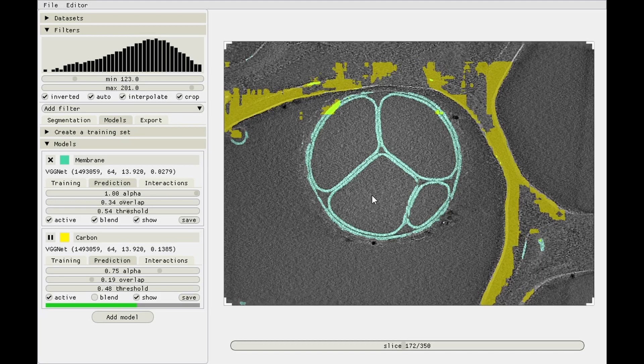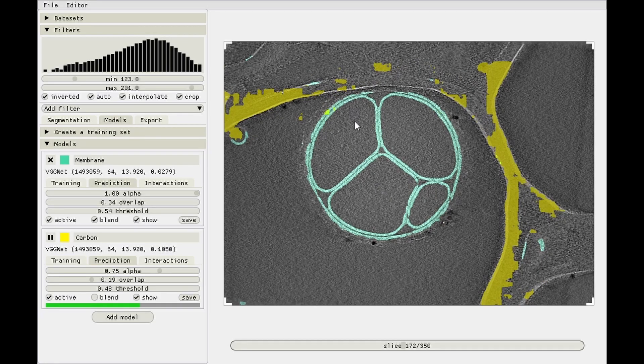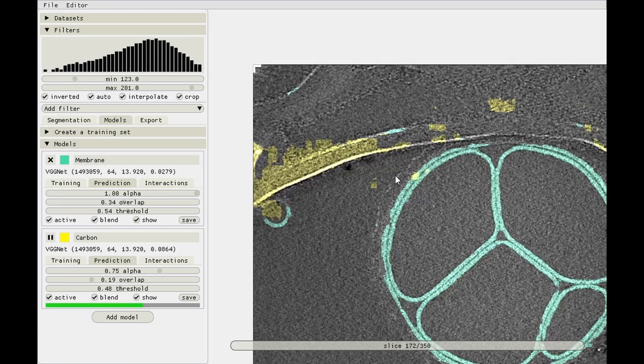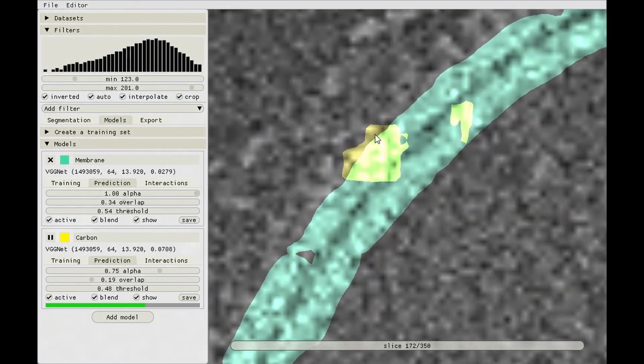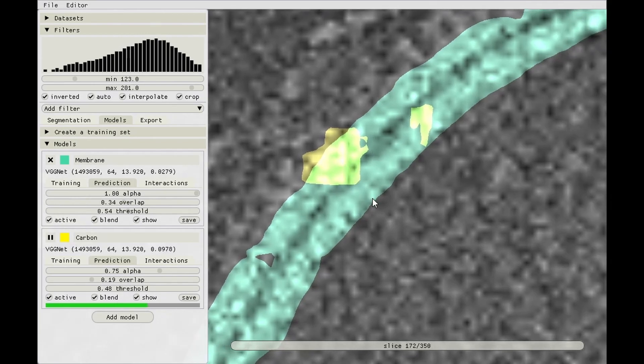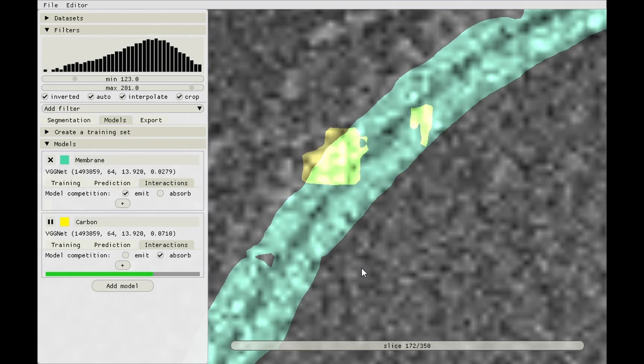Let's activate membrane too. And here you can see that without any model interactions present, as we haven't set those up yet, two models are allowed to both predict the same thing as being other things. So these pixels are carbon as well as membrane. But let's say if we set both models to compete, and the membrane one will emit competition, the carbon one will absorb it, meaning that for every pixel if the carbon model predicts a value that is lower than that of the emitting membrane model, the carbon model's prediction will be suppressed to zero.